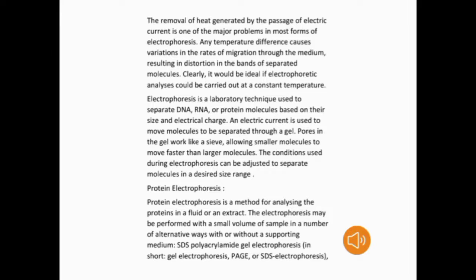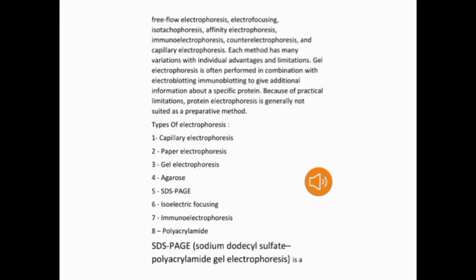The electrophoresis may be performed with a small volume of sample in a number of alternative ways, with or without a supporting medium: SDS polyacrylamide gel electrophoresis, in short, gel electrophoresis, PAGE or SDS electrophoresis, free flow electrophoresis, electrofocusing, isotachophoresis, affinity electrophoresis, immunoelectrophoresis, counter electrophoresis, and capillary electrophoresis.